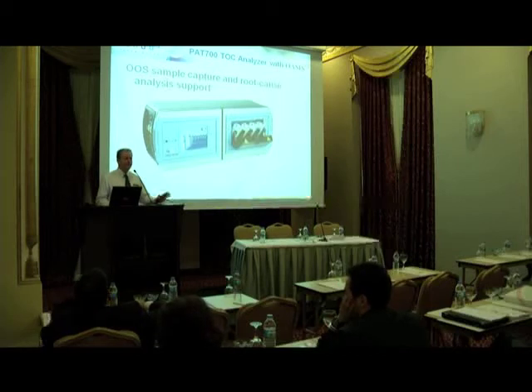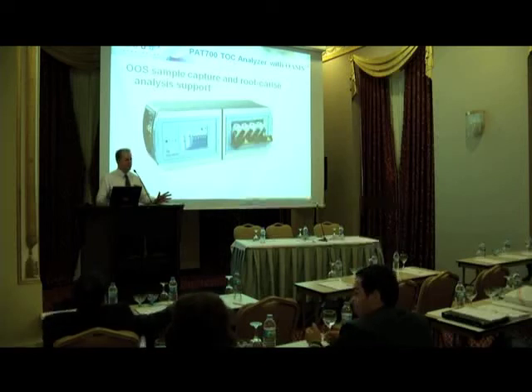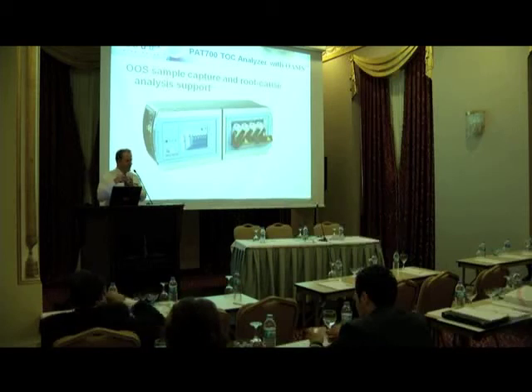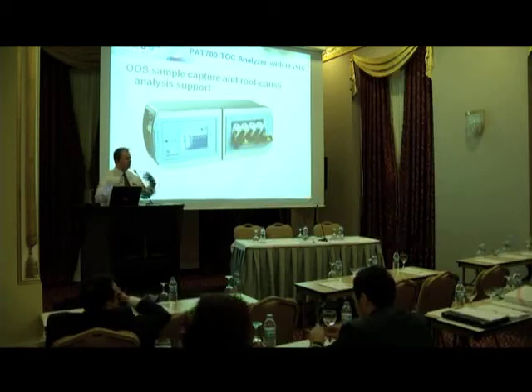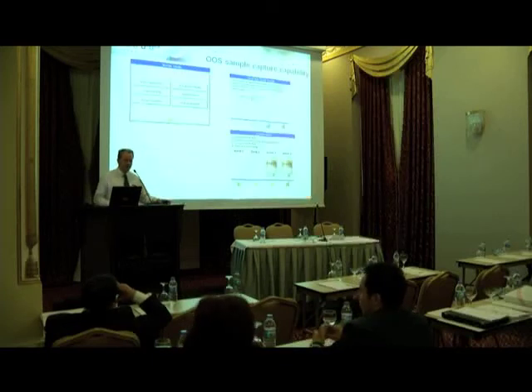One thing that I've observed on water systems is that out of specification occurrences are often transient. Quite often you get a contamination from a point of use. Somebody turns the point of use on, a small amount is sucked back into the system, and you have a contamination event. That contamination in the pipeline will be a high TOC reading, but by the time it gets back to the storage vessel, which is a large volume of water, it'll be diluted down, and you won't be able to measure it. So this analyzer has an excursion capture system built into it.